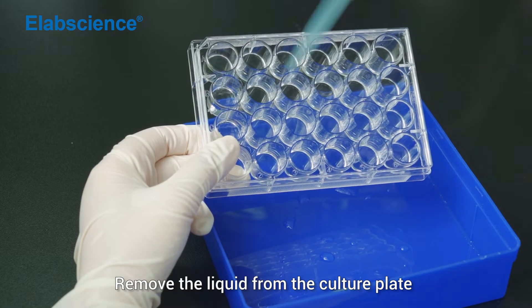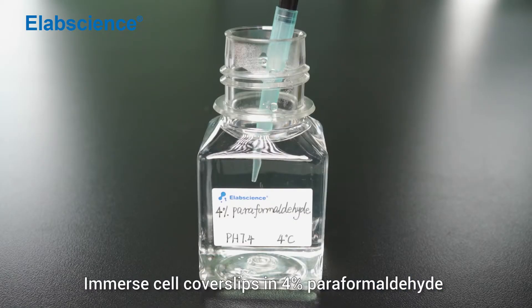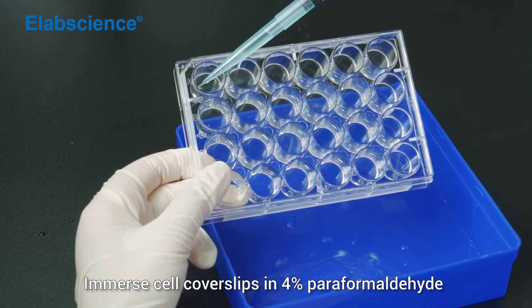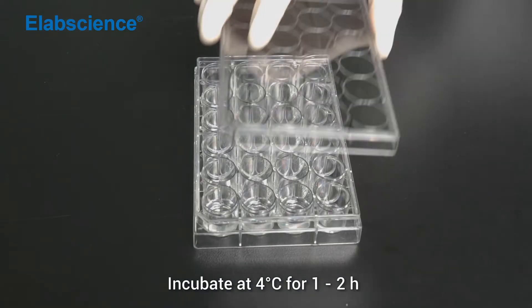Remove the liquid from the culture plate. Immerse the cover slips in 4% paraformaldehyde. Incubate at 4 degrees for 1-2 hours.